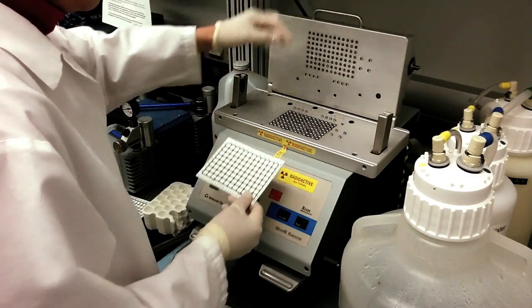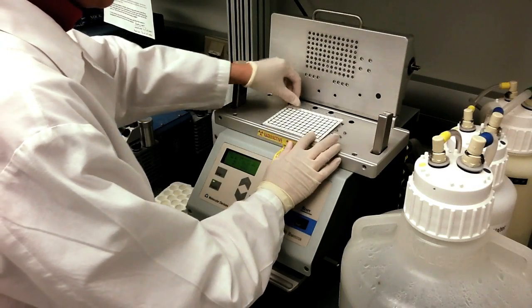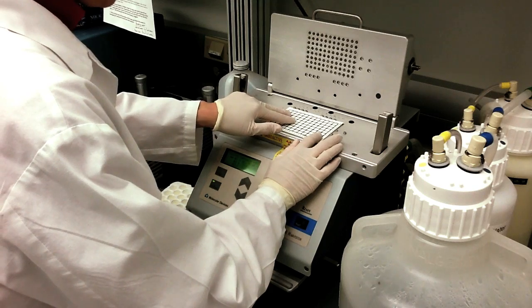Cells are then filtered through glass fiber filter paper using a semi-automated cell harvester.